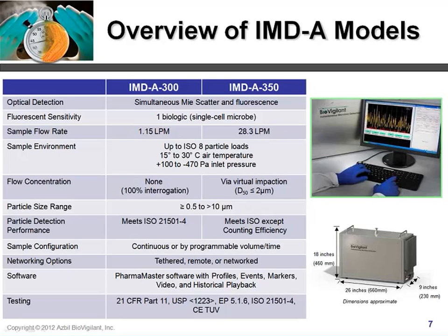So beyond the particle detection metrics, we're currently working on implementing additional procedural steps that would be necessary to offer a fully compliant calibration of the IMDA 300 system.